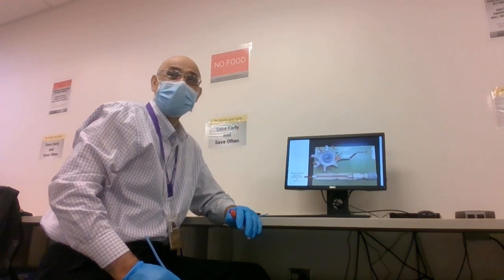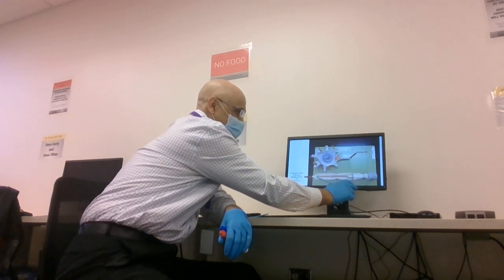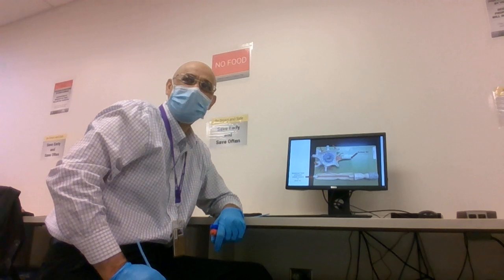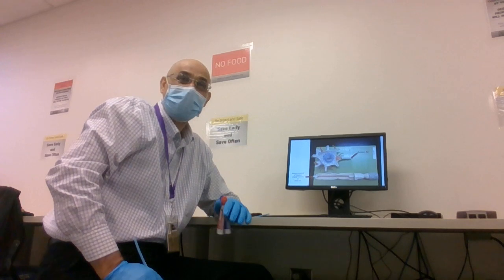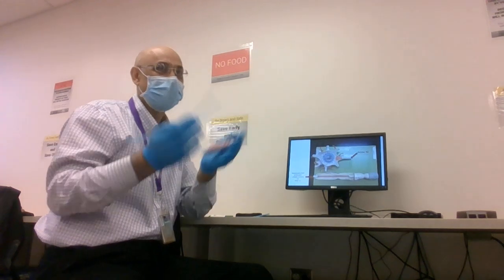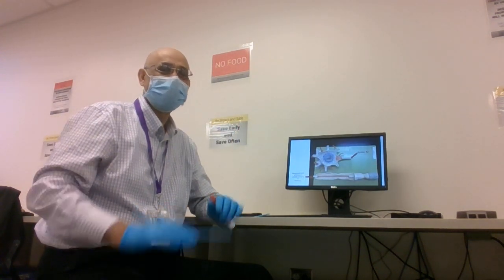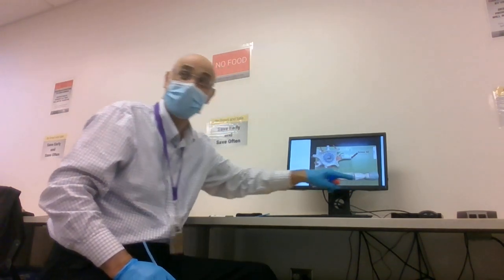One last thing. Think about it. Okay, guys, look at this. What is the structure? This looks like connective tissue. It's each one fiber, an axon fiber. So what's the connective tissue on the axon fiber called? The whole nerve is the epineurium. The fascicle is the perineurium. And what is the individual fiber? Endoneurium. This is endoneurium. Does this make sense now?